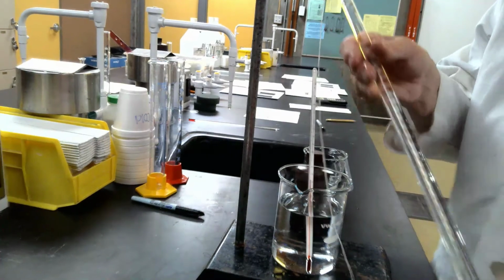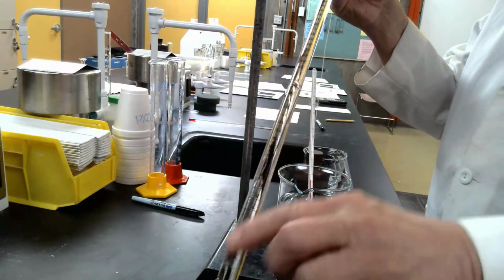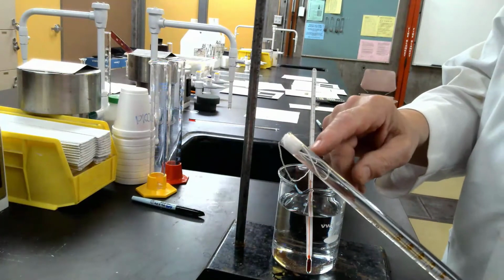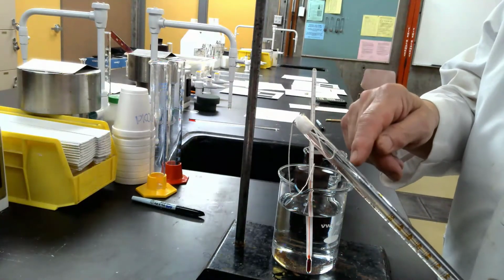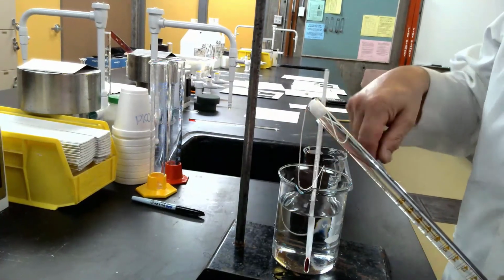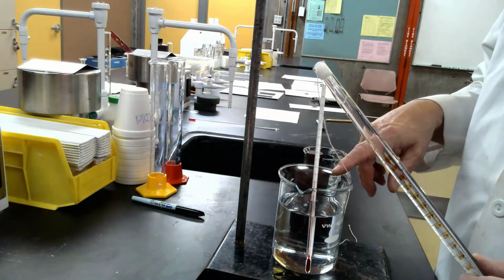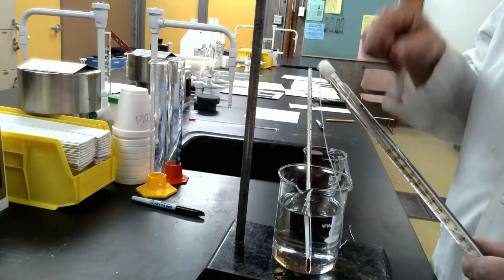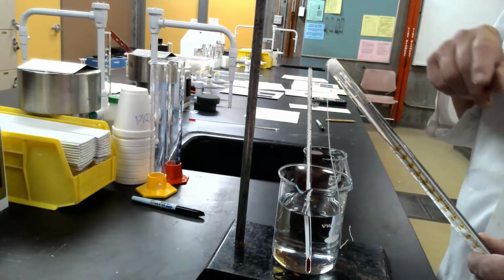My eudiometer has the acid at the bottom, and as I move up, I've got my magnesium. Again, the cotton is just to hold the string, and the string is just to hold the magnesium. Neither serves any other function in there. I have a thermometer in my beaker because I'm going to take the temperature of the water and assume, because my hydrogen bubbles through it, that it is the same temperature as the water.